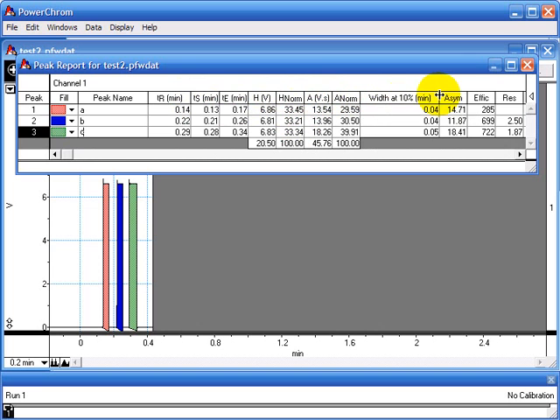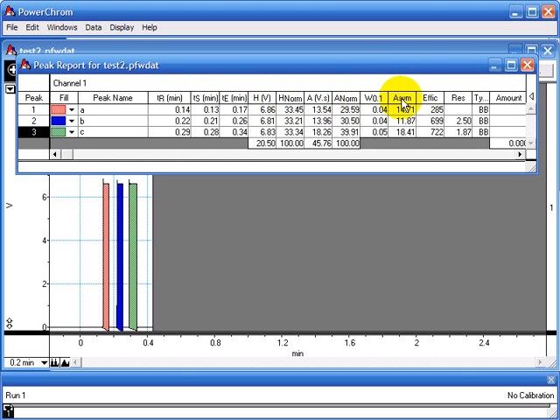Such as the width of the peak at 10% height, the asymmetry of the peak, the efficiency and resolution.